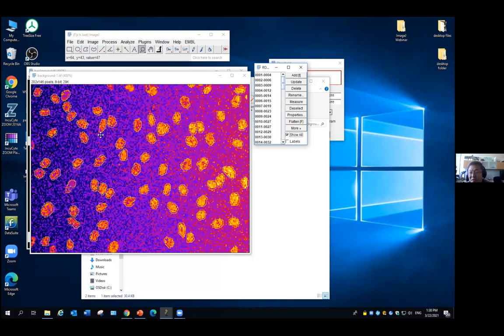I mean, ImageJ is actually a very powerful software, but it's a processing machine. Like any machine, the basic rule is garbage in, garbage out. If your incoming data is not good, no matter how powerful your software is, you cannot expect very good results. If your incoming data is very bad and the software gives you very good results, you shouldn't trust it either. Your data needs to be reasonably good to give you reasonable results.